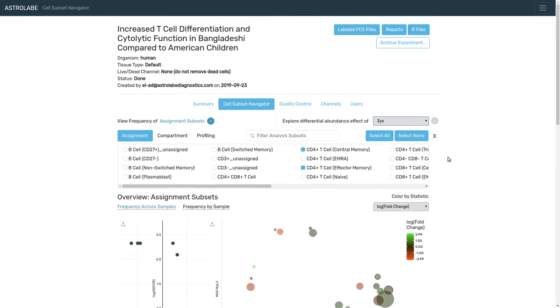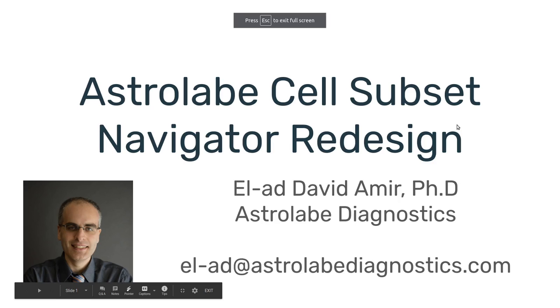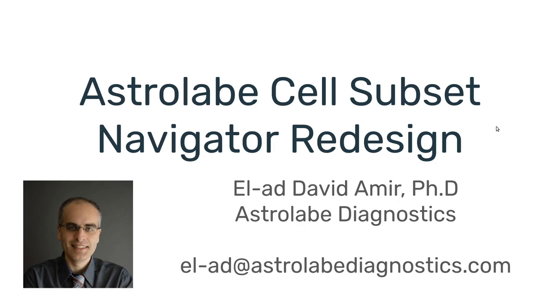In order to reach here, you don't need to do anything. You just upload your FCS files, and that's it. So Astrolabe is really built around allowing you to access your data and unlock the ideas, the insights, the intelligence as quickly and effectively as possible.